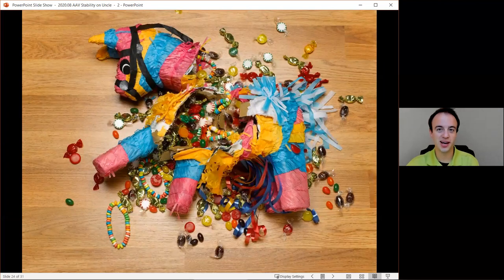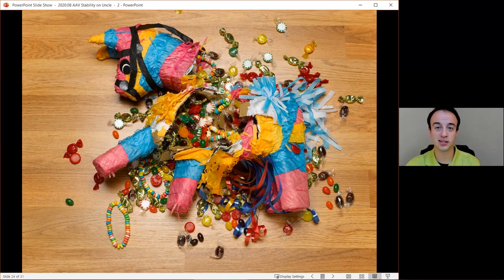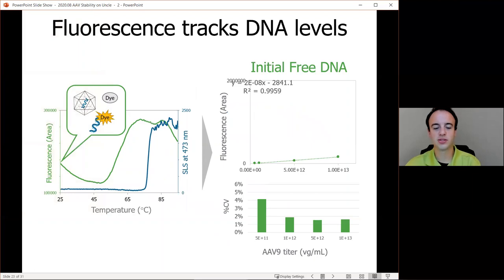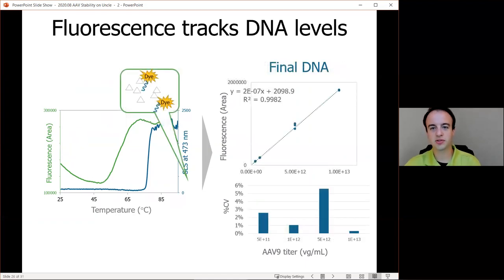So we've cracked open that AAV piñata that I kind of led with. Now I want to show you what other benefits using UNCLE to attack those AAV piñatas can offer. So in this case, we're looking at a dilution series where we're tracking that initial fluorescence intensity. So here that initial free DNA correlates with the amount of free DNA, or that initial amount of fluorescence intensity correlates with the amount of free DNA that we have in our sample with a pretty good CV. So that's also interesting because if we look at the final DNA sample, the final DNA result, our fluorescence intensity continues to be linear with titer. So that kind of indicates to us that we can look at both the final and initial DNA results present in the sample and have a pretty good precision with that as well.